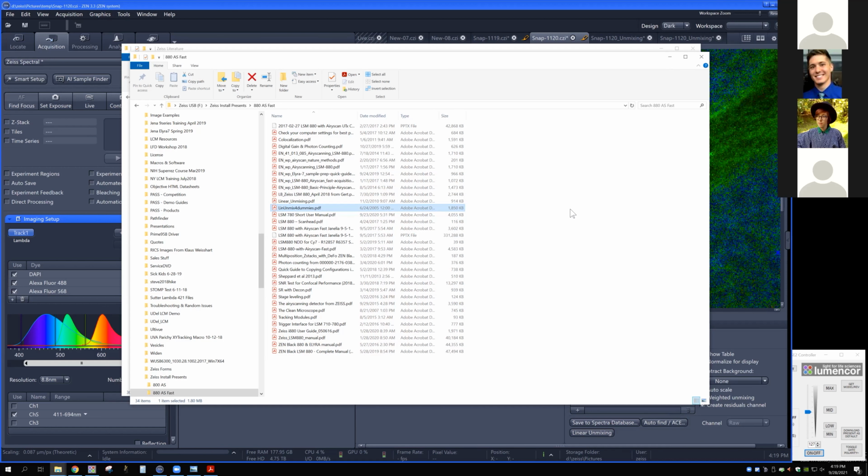So after that, in the afternoon, we did a big breakdown on fluorescence, why we use it, why it's helpful, and why working with filters because of the Stokes shift is really helpful. And we talked about different ways to configure that, both for wide field systems, and also for either confocal mode or Airyscan or spectral imaging on the 980. So that's really a pretty good broad coverage of all of the hardware elements of the system.